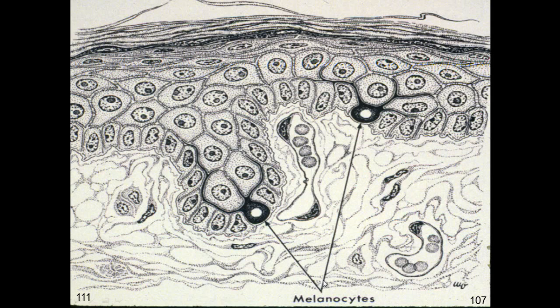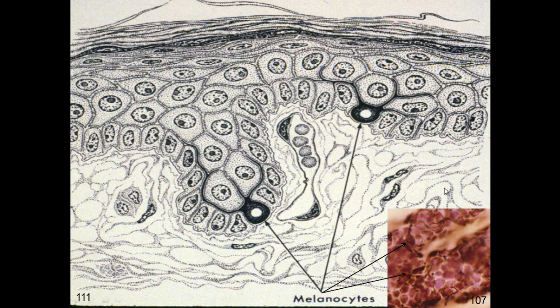And here we can see them. These are melanocytes. It's a dendritic cell that has processes that go from itself to other cells, and you can see those here. They do not make desmosomal connections with adjacent cells. As a consequence, they appear as a clear cell on the stratum basale. So they're located on the base. And here you can see those.